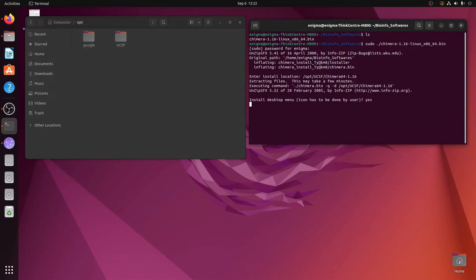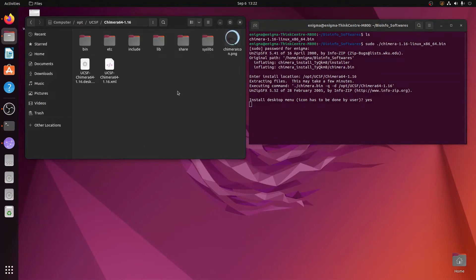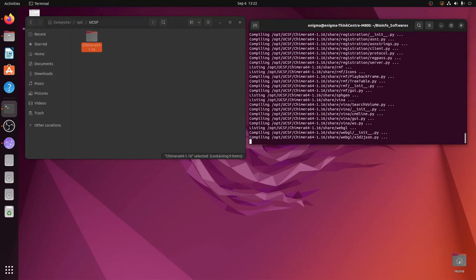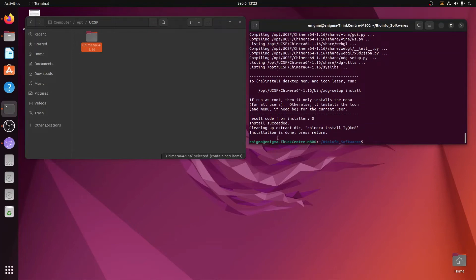The cursor is blinking but that does not mean nothing is happening — Linux is installing the installer file into this folder. New files and folders will be created inside. Once installation is done it says 'press return,' so press Enter. The terminal returns with a dollar symbol, meaning installation is complete. Chimera has been successfully installed.